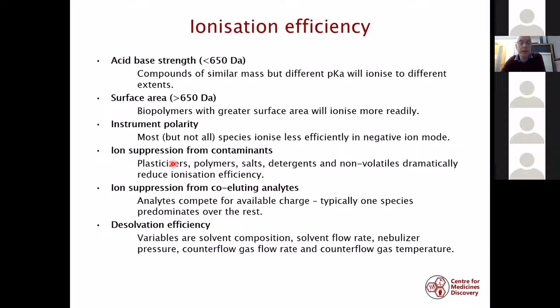Also, we're going to experience differences in desolvation efficiency. So the more efficient your desolvation, the better, but the variables here are going to be solvent composition, which is going to change throughout an LC-MS run, the solvent flow rate, nebulizer pressure, counterflow gas flow, and also counterflow gas temperature. And all of these things can affect the ionization efficiency.